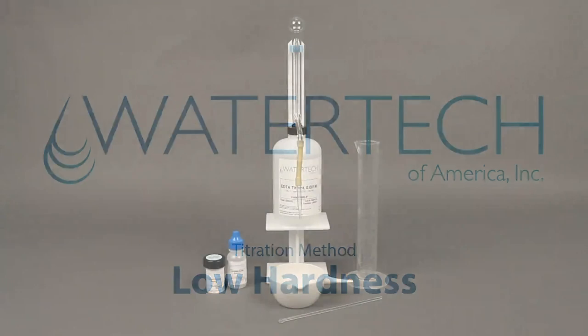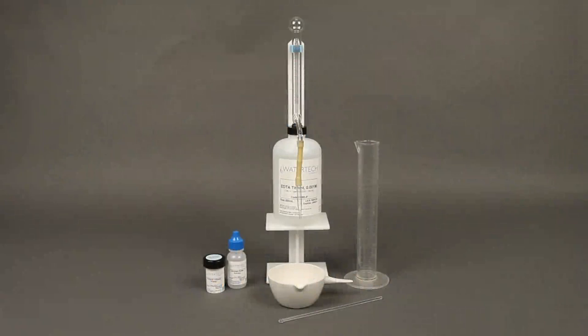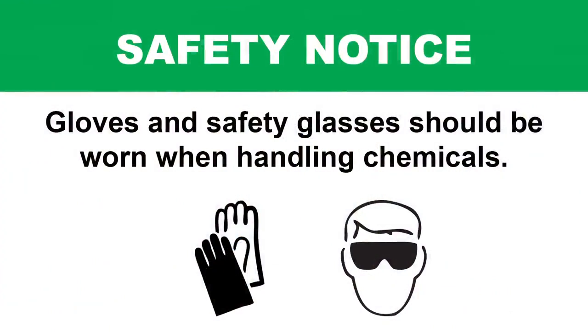This is a demonstration of a low hardness test. Anytime you are about to handle chemicals, you need to wear the proper safety equipment. Gloves and safety glasses should be worn when performing this test.